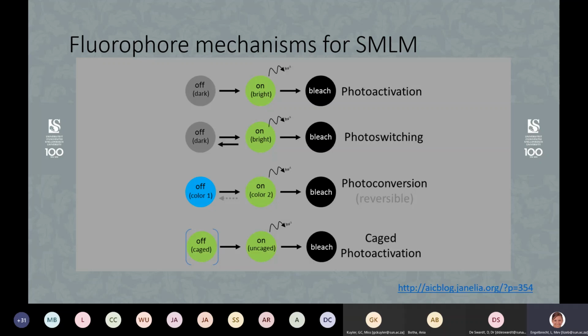One last type is where you have a fluorescent marker, which is what they call caged. I think it's a conformational change. The UV light causes that conformational change and it switches on. And again, you can image a blinking experiment.